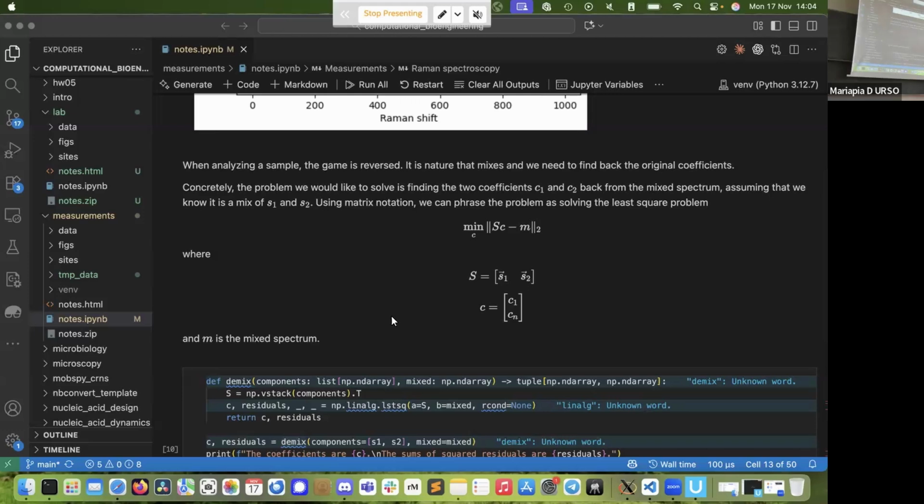And the S is composed from the single spectra, and the C is the unknowns, our variables here, the concentrations. Then we can minimize this. And in the perfect case, if there are no numeric or measurement errors, that should be minimized to 0, right? It should have 0 residue. Of course, measurement-wise it will never be exactly zero, but in principle, this zeroes out.